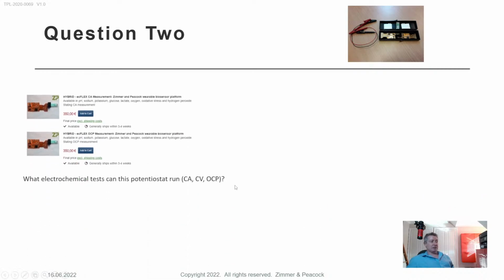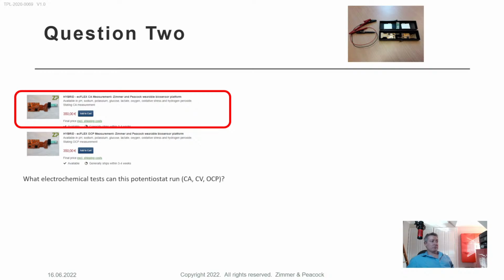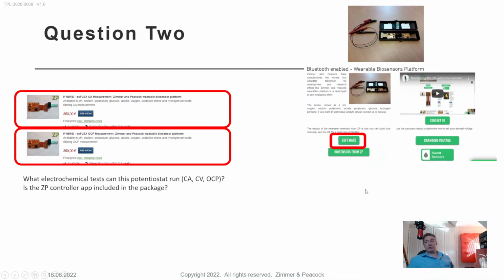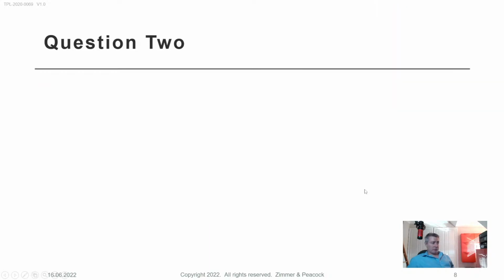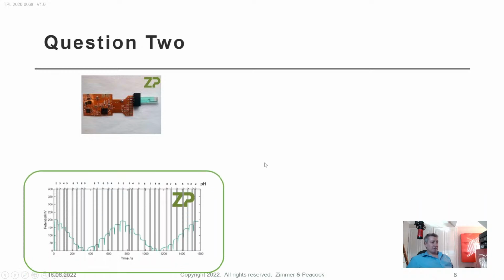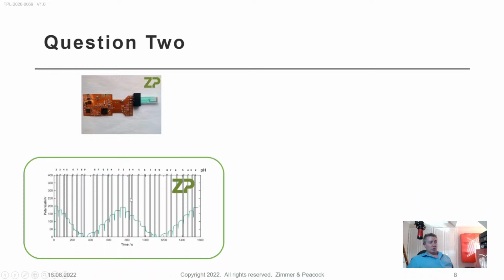It's just a bit of background on this. The ecFLEX does have 2 types, so it's worth testing whether you've got the chronoamperometric model or the open circuit potential model. In this particular case, we're talking pH sensing, so obviously the method of choice is OCP, open circuit potential. It's probably worth knowing that the software is available for download off our website. So all good. Back to the real question now. What are we expecting from an ecFLEX with a pH sensor? We're expecting to be able to get results somewhat equivalent to this. It's off our website. We're going from things like pH 2 down to pH 9 and then back to pH 2.